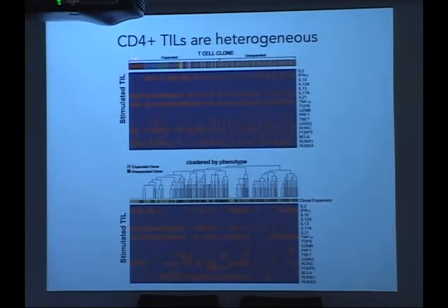For instance, this expanded clone largely does not express interferon gamma, whereas this does. And you can also see that if you look at unexpanded versus expanded and you cluster them differently by phenotype, certain phenotypic groups are more present in unexpanded versus expanded clones.